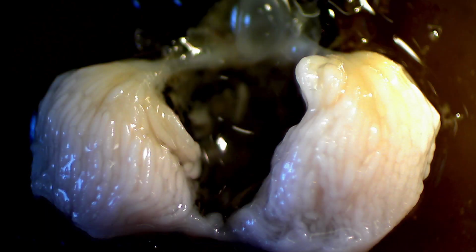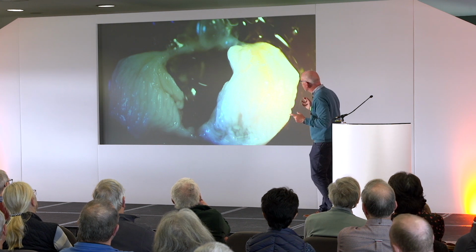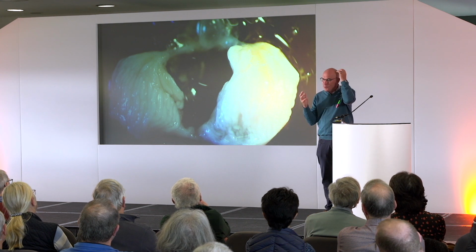I think you must probably guess this is queen's ovaries. One of the problems is it's very, very easy to take a piece of a bee out in an abdomen, but it's very hard to take a photograph once it's there. This one's great because it gives you the full view.